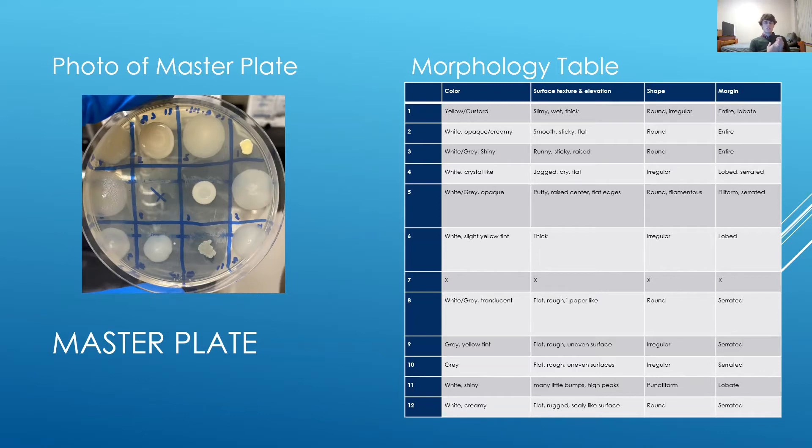The master plate allows us to compare different colonies. After comparing mine, which you can see in the table, I likely had only 10 unique isolates. Isolate 7 had some contamination during the streak plating and didn't grow. Isolates 9 and 10 were likely from the same colony, which raises an interesting question that I will bring up when looking at the antibiotic production tests.